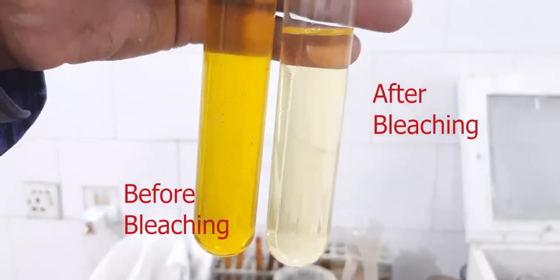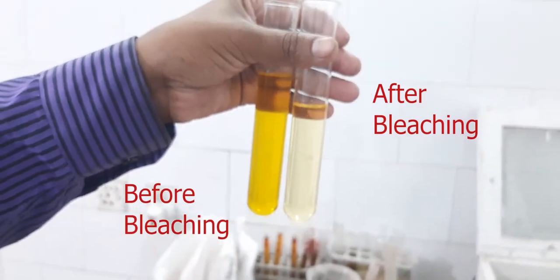At this point, the distinction between the raw oil and the bleached oil is readily apparent.